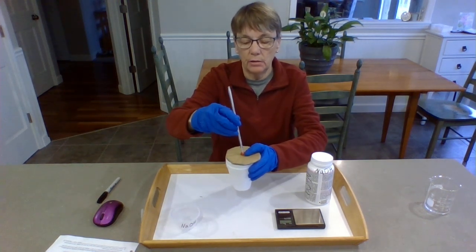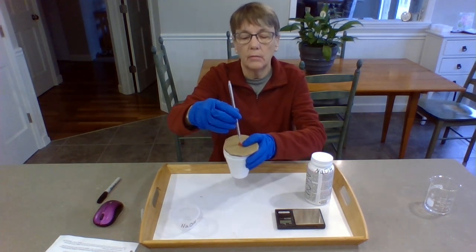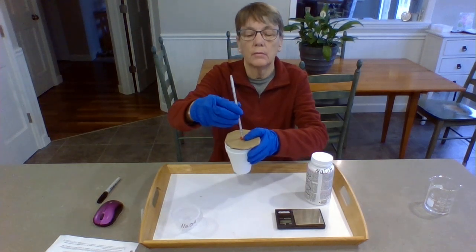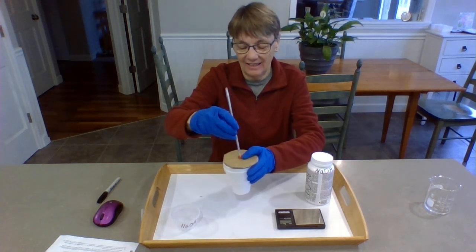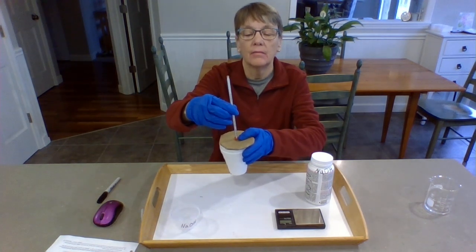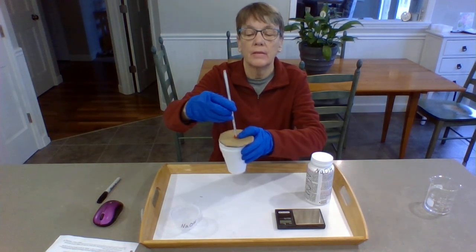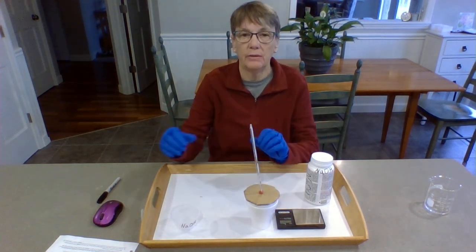Yeah, the temperature looks like it might have reached its peak. Maybe not. Yeah, we're going to call the ending temperature 27.5 degrees Celsius.